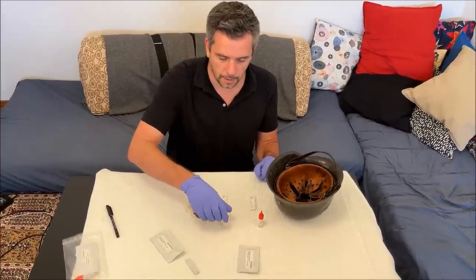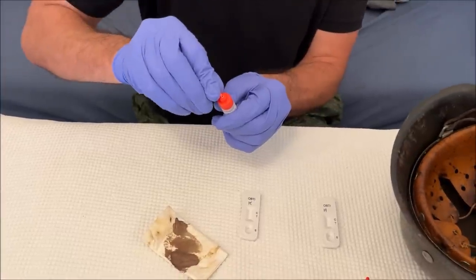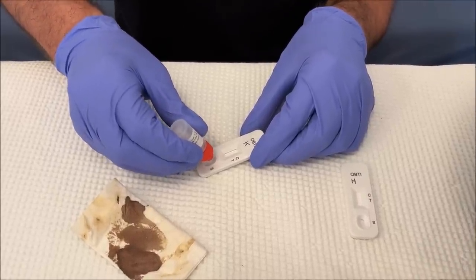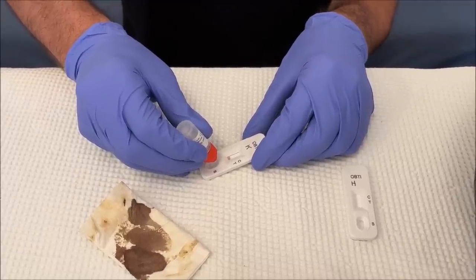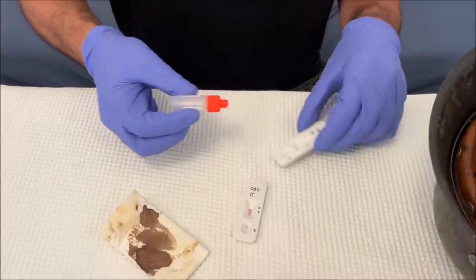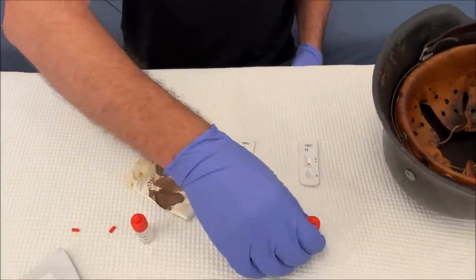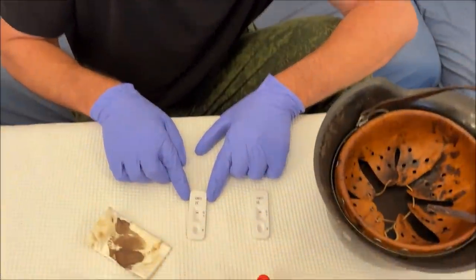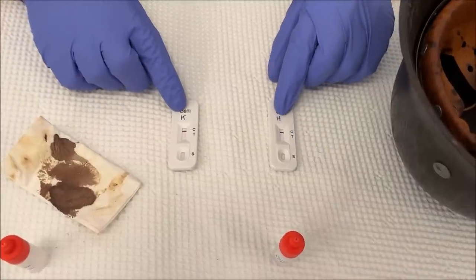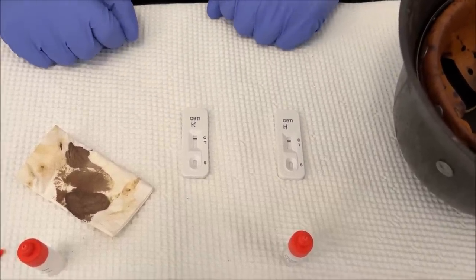Okay, so here we are the next day. This is the K test for the kleenex. According to the instructions you're supposed to break off the tip and then put three drops on it — it's kind of like a COVID test or a pregnancy test. One, two, three — that's for the kleenex with my blood on it. And now three drops for the helmet as well. After waiting ten minutes, both tests are negative. The C means control — it shows the test worked — and if there's human hemoglobin the T line is also supposed to appear, but in both cases the T isn't marked.